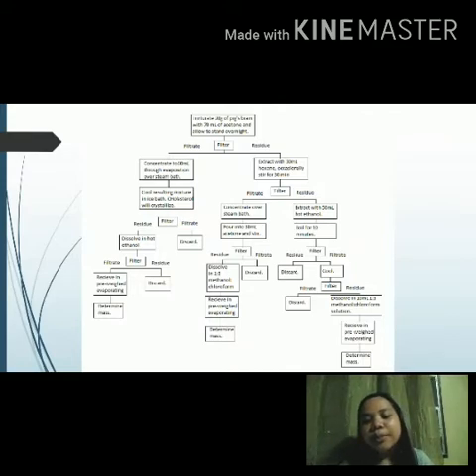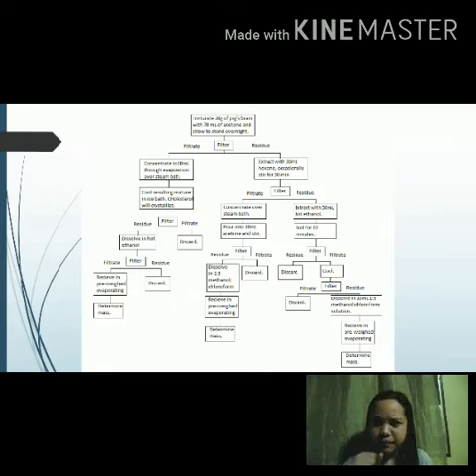To answer post-laboratory question number 3, why can phospholipids be extracted by hexane? It is because hexane is highly nonpolar and phospholipids are amphiphilic, but favor nonpolar because they have two fatty acid chains unlike the others. So hexane will be effective in binding with the phospholipids.